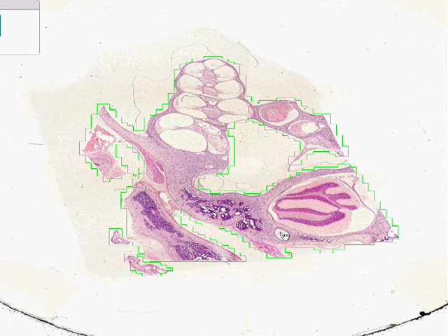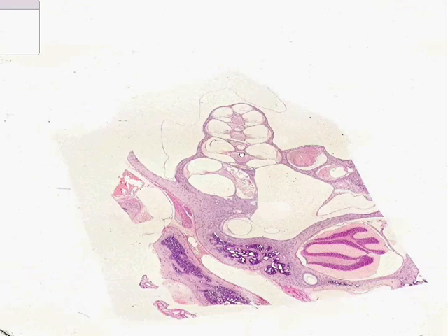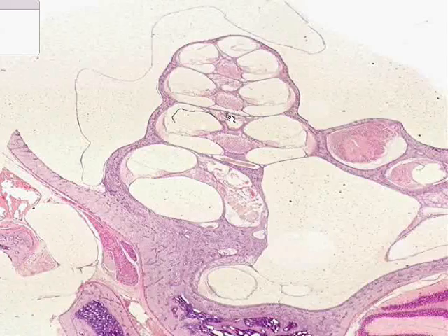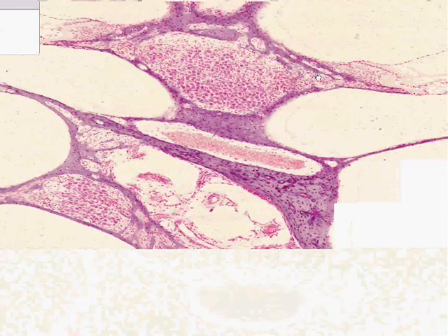Let's look at the cochlea and look at the salient features of it. This is the cochlea. It looks like little cuts through a snail. Grossly, it actually looks like a snail. In the cochlea, you will see the various scala. One way to identify the scala is to look at the parts of the cochlea in which you see this thin membrane, which is called the vestibular membrane.